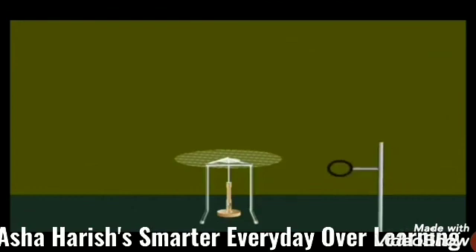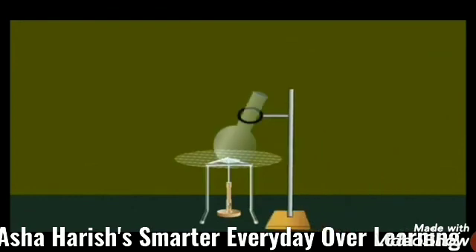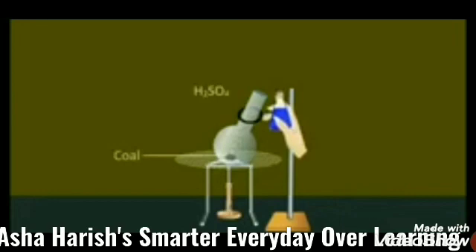Estimation of nitrogen by Kjeldahl's method. Here we have to take one Bunsen burner with the help of a tripod stand and wire gauze with the help of one stand. We have to place one Kjeldahl flask on the flame, and that Kjeldahl flask contains the organic compound, which is coal. Here you have to take coal, and copper sulfate you need to add to them. Here copper sulfate is acting as a catalyst of the reaction.